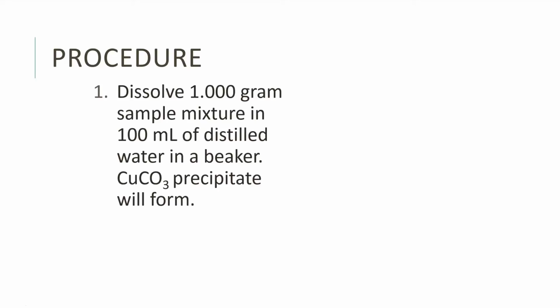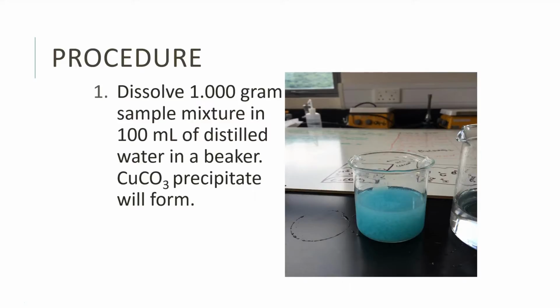Procedure. To begin this experiment, you must first dissolve the massed 1 gram sample of the mixture in a beaker filled with 100 milliliters of distilled water. A solid will form which will make the solution look cloudy. This solid is the copper carbonate.